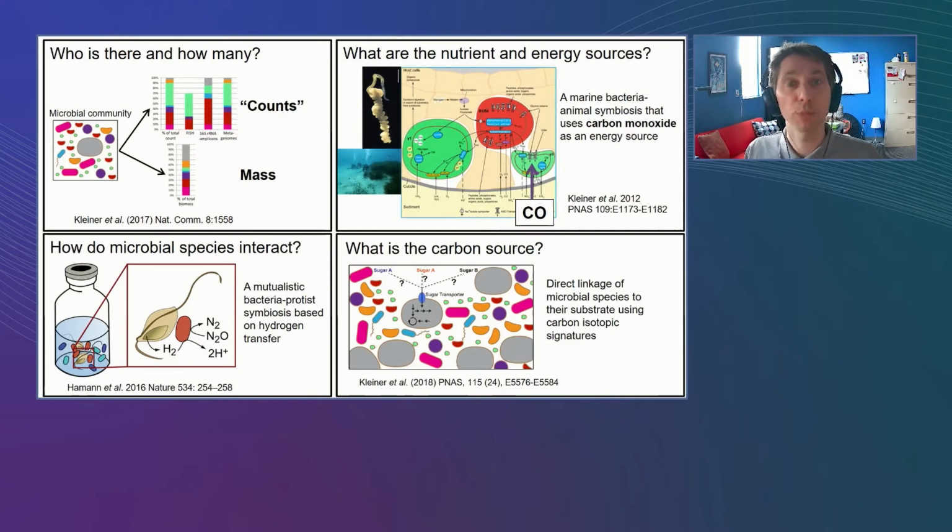And then, of course, after metaproteomics allowed us to generate this hypothesis, we followed up with other methods. We did physiological incubations and measured in situ. So metaproteomics here was really the key to focus our perspective on what is going on in the environment. And then, of course, you can also look at microbial species interactions, particularly if you have a system where you can somehow manipulate different environments or artificially induce some environmental change, then you really can start teasing apart interactions in these communities. Another method, based on metaproteomics, that we recently developed, allows us to look at carbon substrates of microbes in their respective environment.